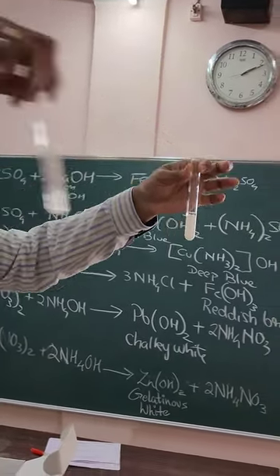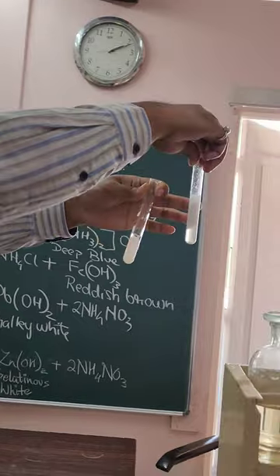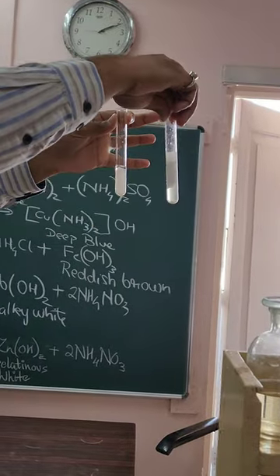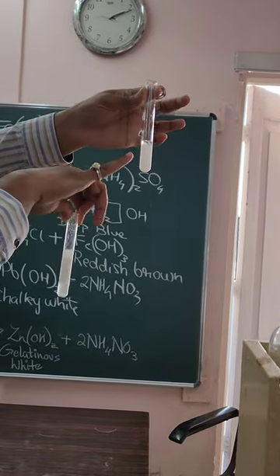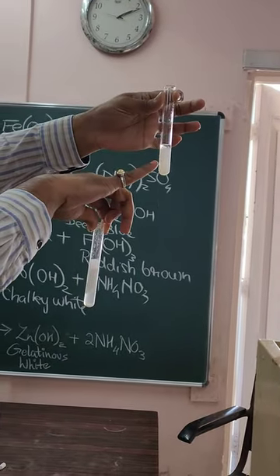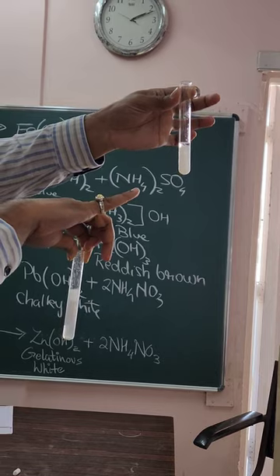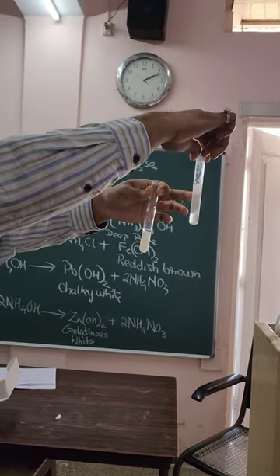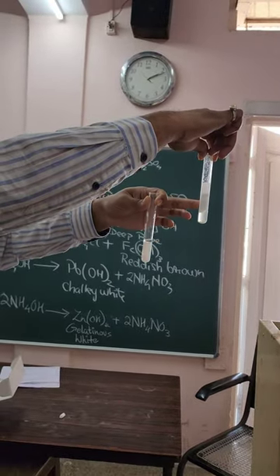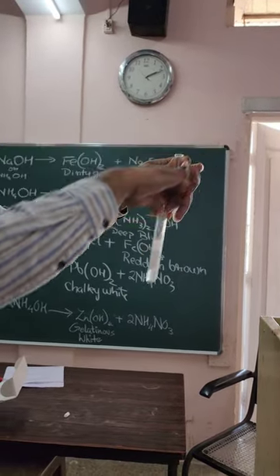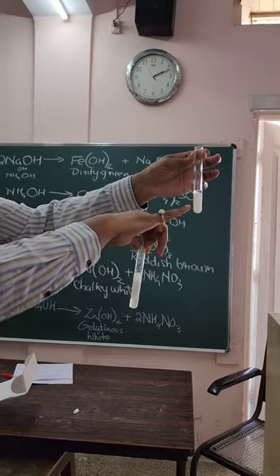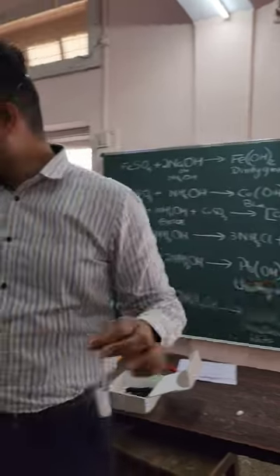This is lead hydroxide — the PPT which is chalky white. You can see that it is opaque. And this is zinc hydroxide — the PPT which is a little transparent. It is gelatinous. And this one is very opaque. So, this is chalky white and this is gelatinous white.